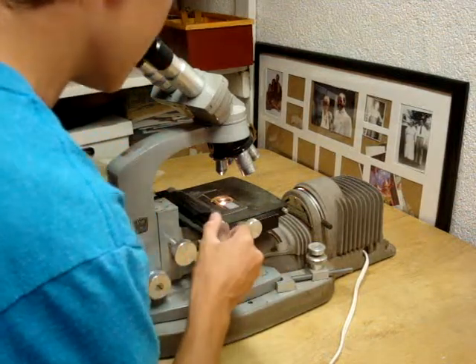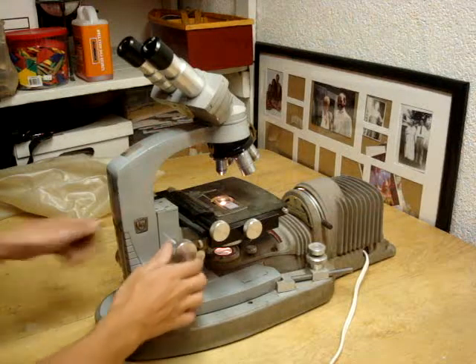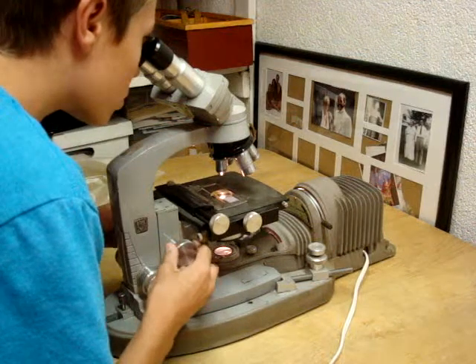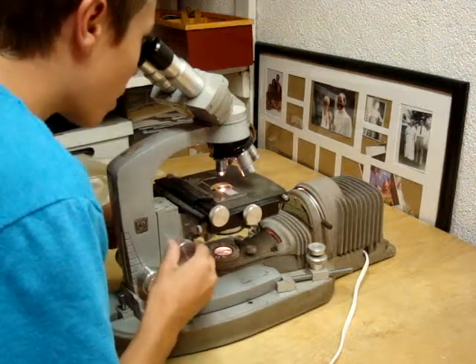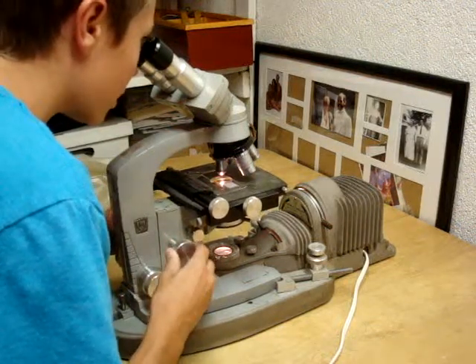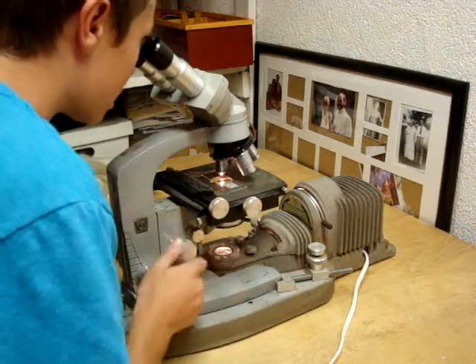Mine has knobs to center it on the side. Then what you use is you use the coarse adjustment to find where the specimen is that you're looking at. And right there is the specimen.